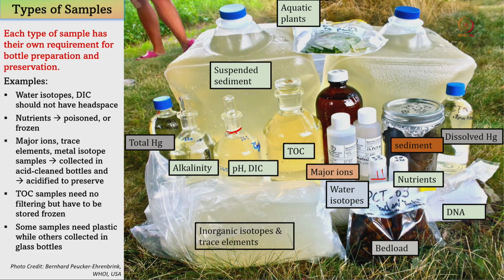There will be atmospheric exchange. When I collect 20 samples and bring them to my lab and analyze them, I will see that all of them are showing me random values or maybe the same values. Because they have exchanged with the atmosphere and now they are showing me the same values, or random values. Then I know that some error occurred during the sample collection or during the sample shipping. Therefore, I am getting such erroneous data.